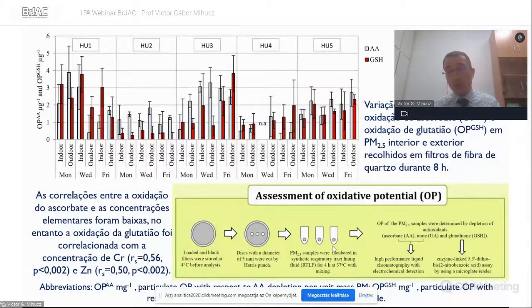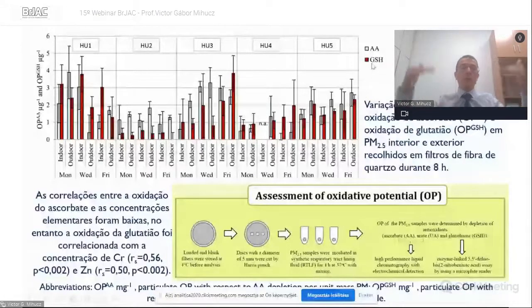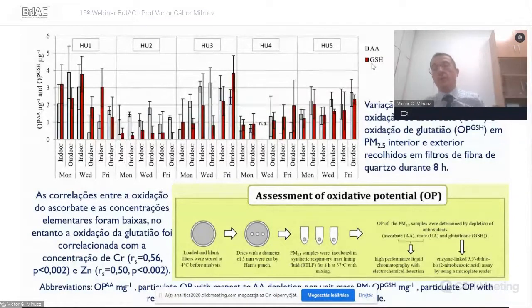Glutathione determination is very, very complicated. It's oxidized very easily. It also interferes with ascorbate and other compounds. So by chromatographic means, it's very, very difficult to determine. And of course, then we observe, if you look at this graph here, there are no columns for urate depletion. We started with a 200 micromolar concentration of ascorbate and reduced glutathione, and urate was inert. Depletion occurred in the case of ascorbate and reduced glutathione. This shows only this campaign, but we also showed seasonal changes.